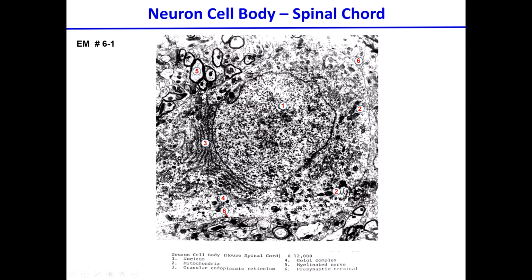In this particular position, it's small, but it still could be visible. This cell has actually a number of vesicles inside, and is getting close to the membrane of this other cell. And you can see here another one. You can find presynaptic vesicles, so this means that this is a postsynaptic cell, and these are presynaptic cells that are coming to it. Questions?